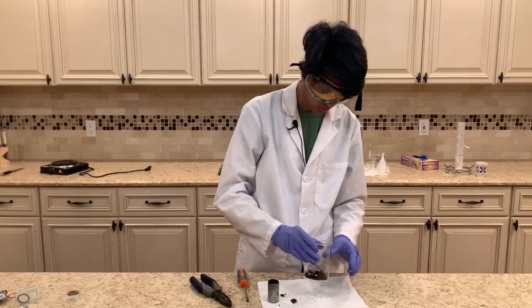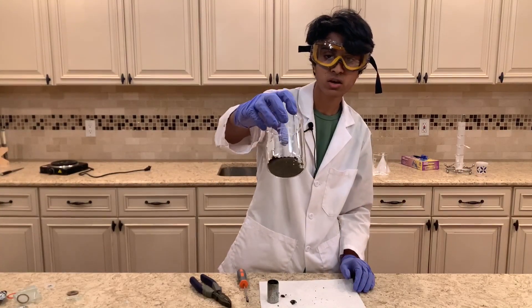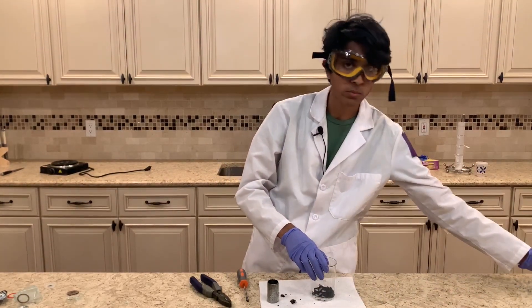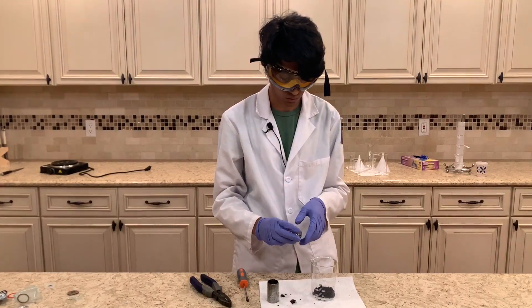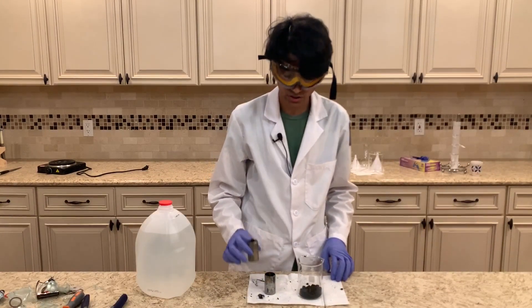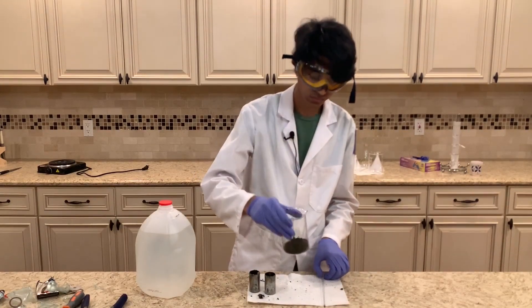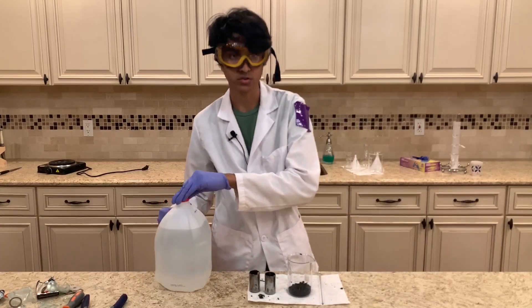I'm going to start scooping out the manganese dioxide. This is all the manganese dioxide I was able to get from this battery. I have one more battery, so I'll repeat the experiment off camera before filtering it out. I just repeated it for another battery, so we have some more manganese dioxide now. We can start filtering it by adding some distilled water.